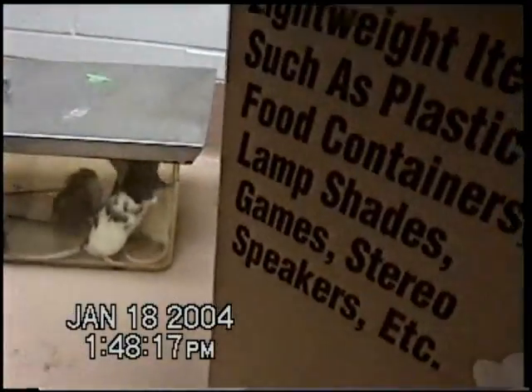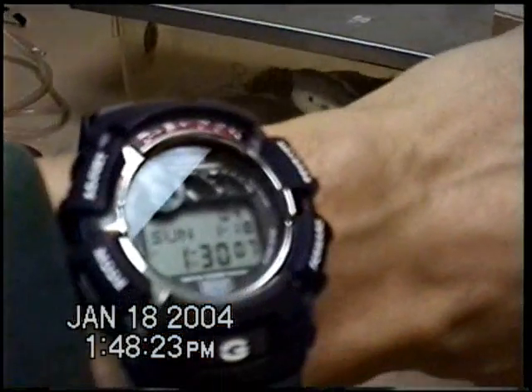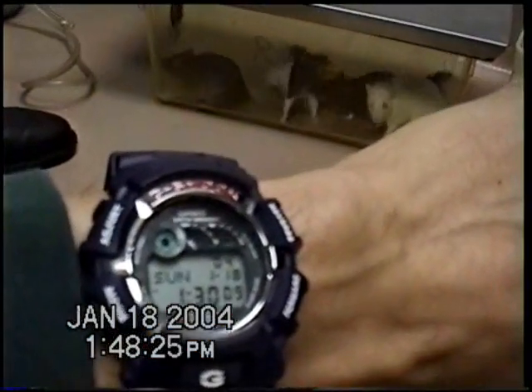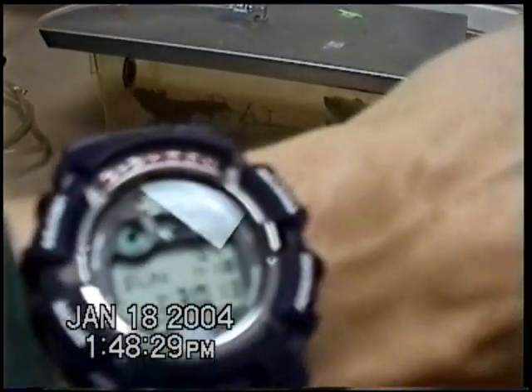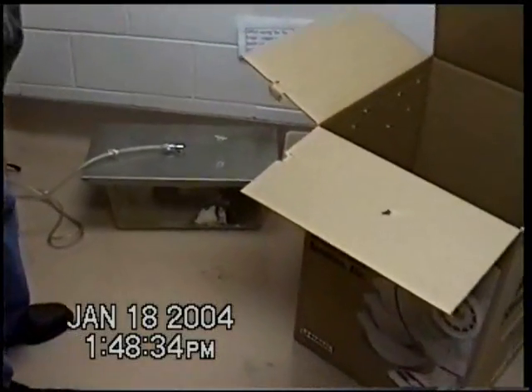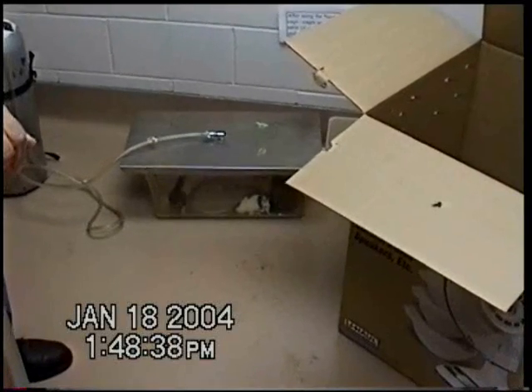Just one minute after. The CO2 is heavy, it stays down. Is there one minute yet? No. Well, it's been there.